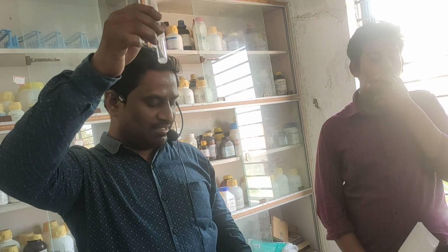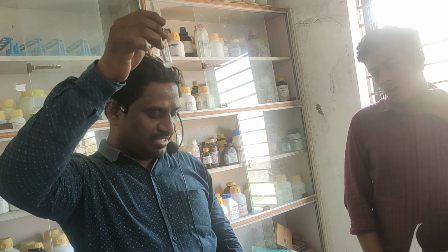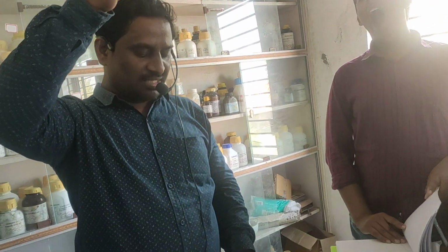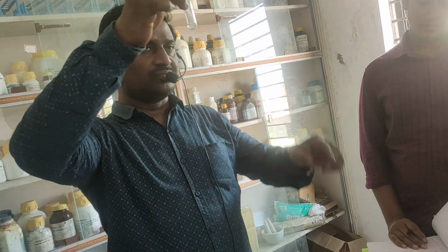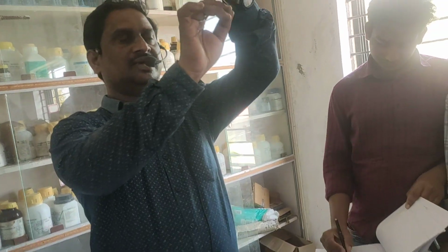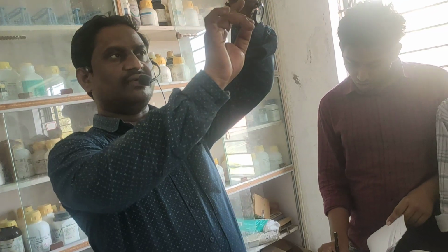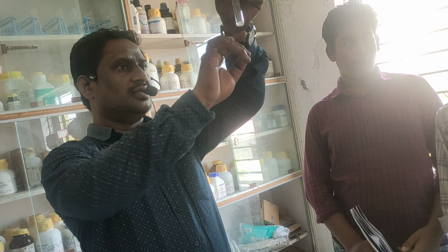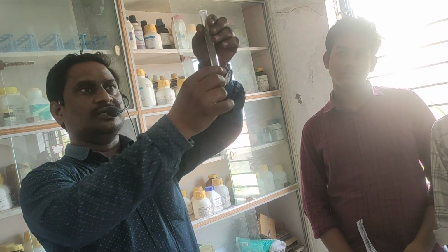We should take the salt, add 1 ml water, heat it, and pass that vapor into lime water. Lime water does not turn milky. Lime water is not available here either, so we are not doing the confirmation test. For the given salt we add 1 ml water and heat it. When you heat it, it will boil.